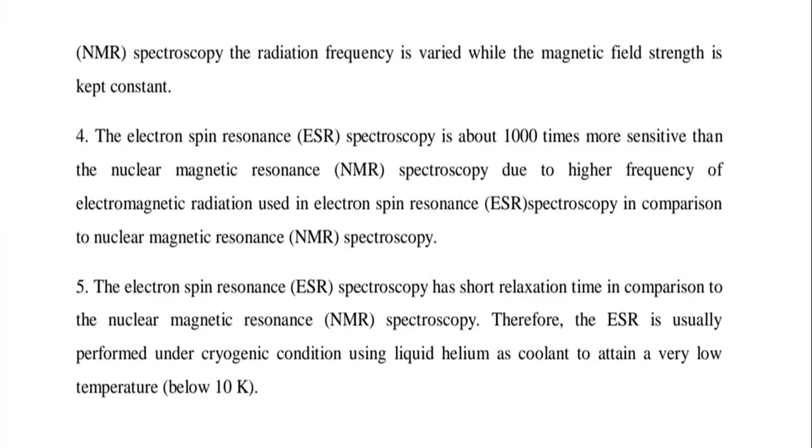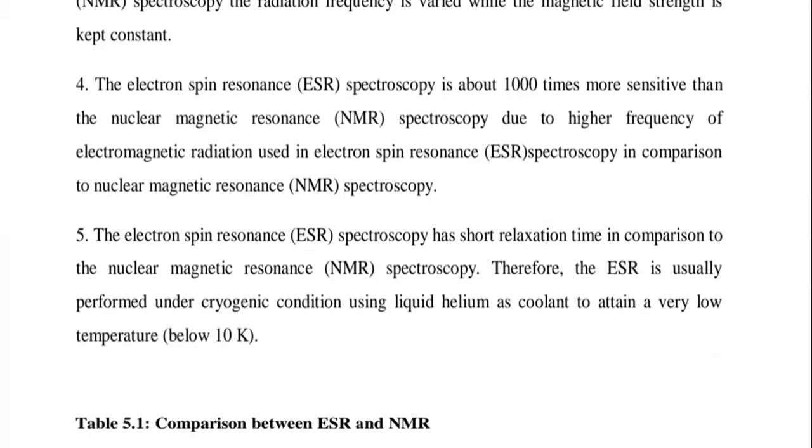Fifth point: ESR has a short relaxation time in comparison to NMR. Therefore, ESR is usually performed under cryogenic conditions using liquid helium as a coolant to attain a very low temperature, near about 10 Kelvin.